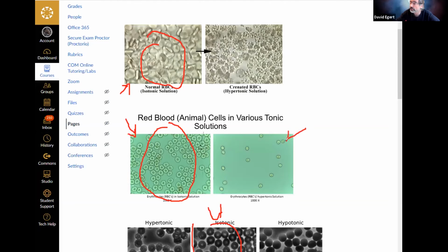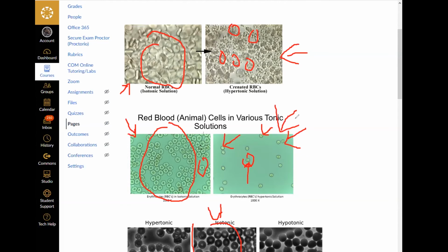Here you can see what happened to these cells. Did they shrink? Yeah, they shrink. Take a look, compare this to this little spiky dealy bopper. Here you can also see, like I said, the little cytoskeletal elements kind of poke out. I always think they look like little puffer fish or something, but they get all spiky and small. What test tube would they probably look like this in? Test tube 5. Yeah, exactly.